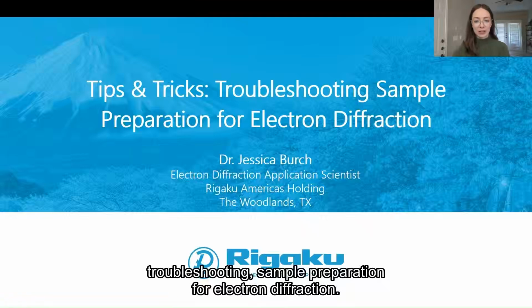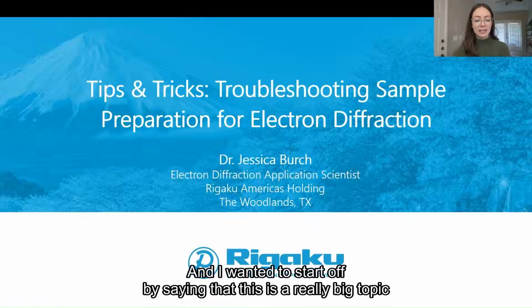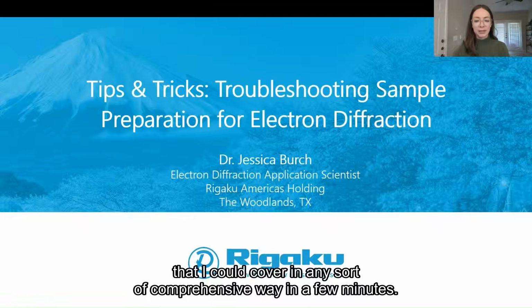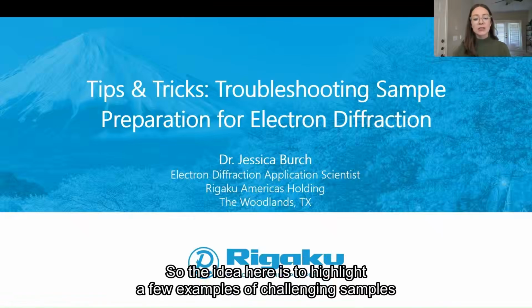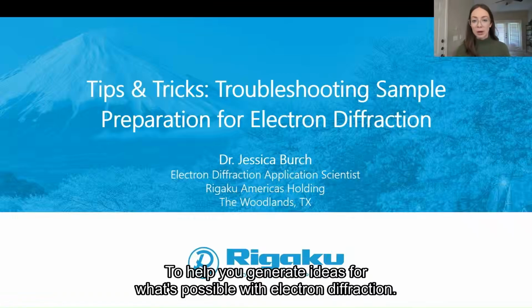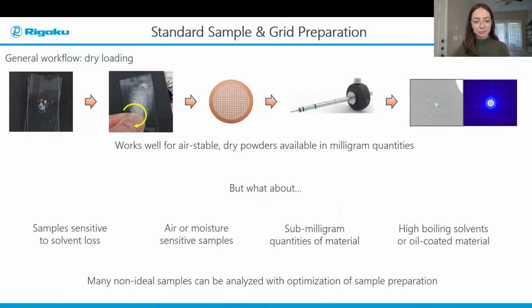For electron diffraction. And I wanted to start off by saying that this is a really big topic and not something that I could cover in any sort of comprehensive way in a few minutes. So the idea here is to highlight a few examples of challenging samples and what we were able to do to overcome those challenges to help you generate ideas for what's possible with electron diffraction.